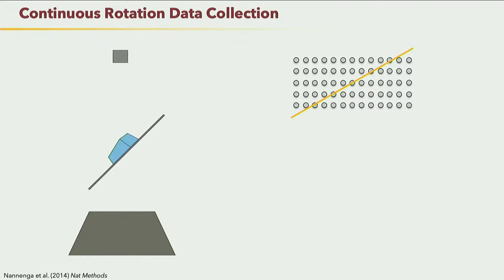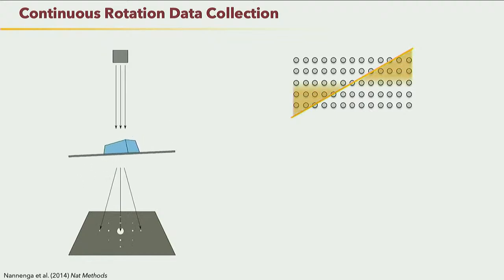But what we do is we take the stage and we get the stage rotating, kind of like what you do for X-ray, you'd be oscillating. We don't oscillate because the stage can't quite do that, but we just continuously rotate. And as it continuously rotates, you turn the beam on, and the camera runs very, very fast and records the diffraction patterns as the crystal's rotating, which means you sample this volume of reciprocal space up here.